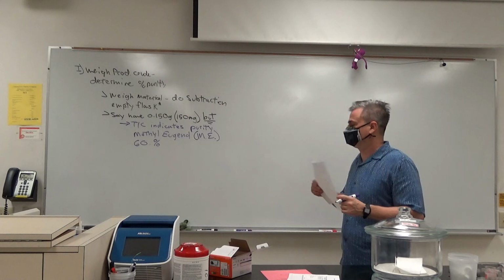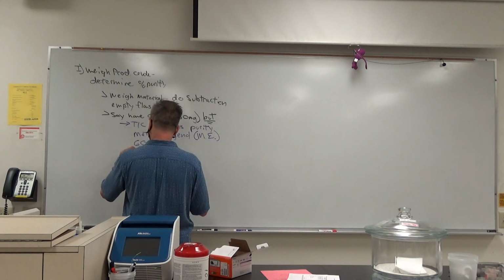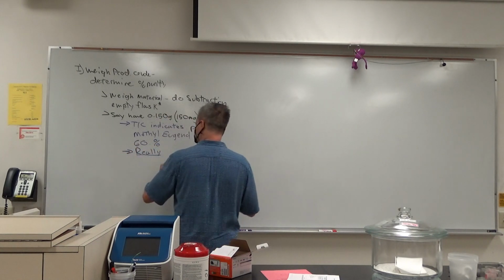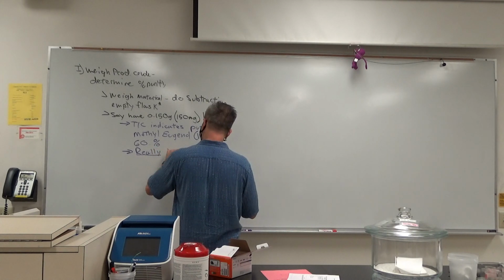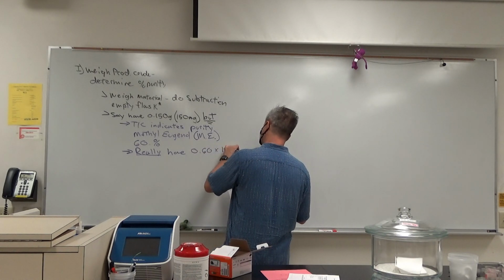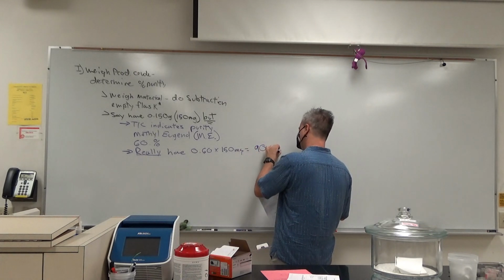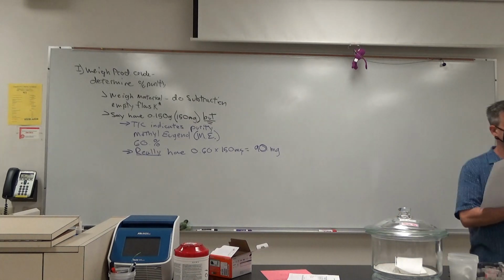Then you really have 0.60 times 150 milligrams, which equals 90 milligrams. Does that make sense?